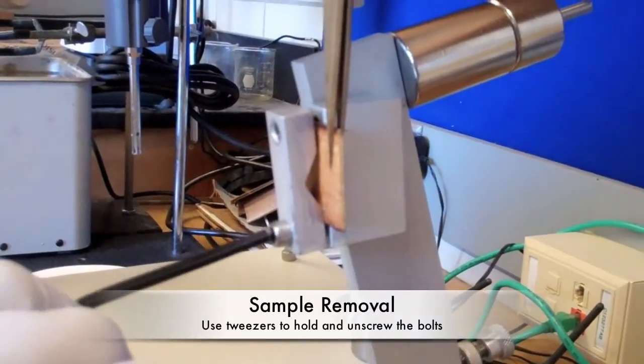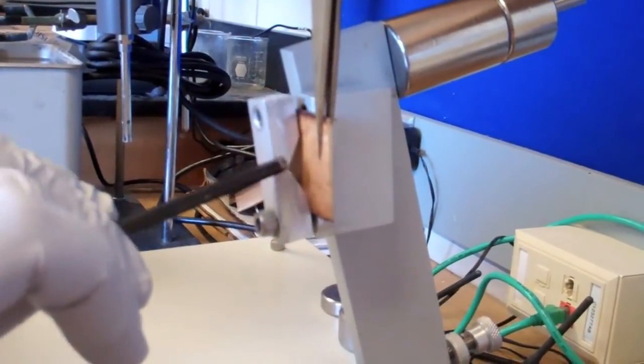To remove the sample from the gate, use a pair of tweezers to hold the sample and unscrew the gate.